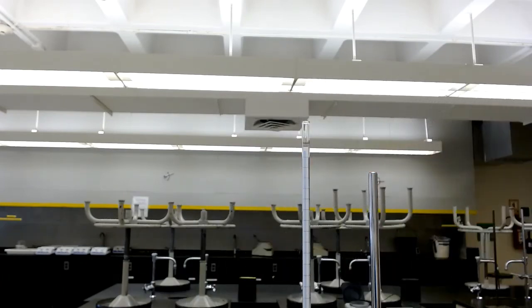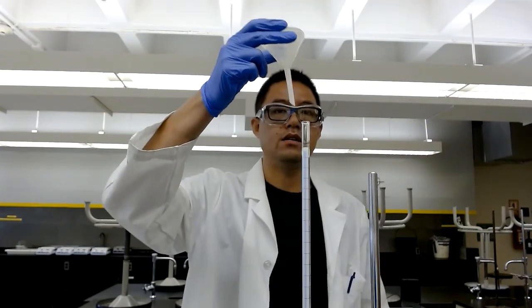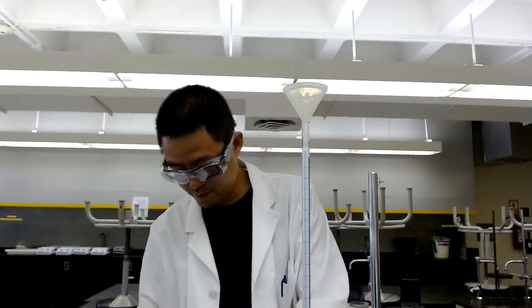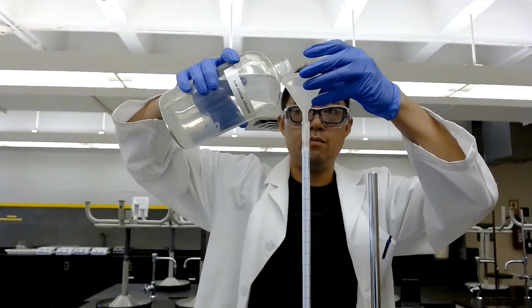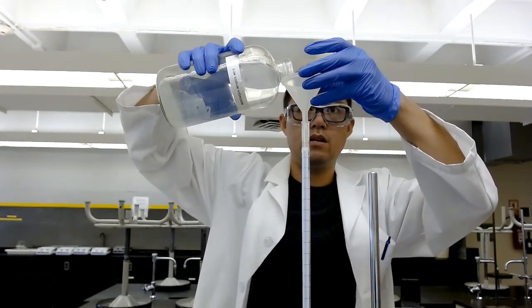How do I do that exactly? Put a small beaker at the bottom, take a stemmed regular funnel and put it on top. Make sure the bottom valve is closed, and then pour slowly.